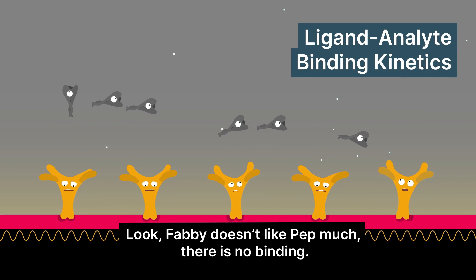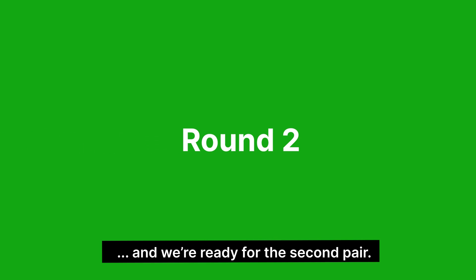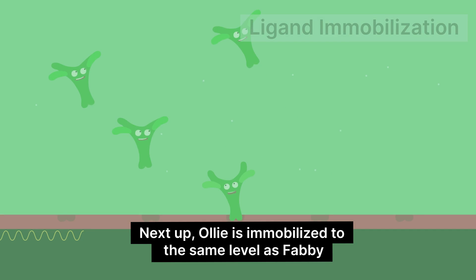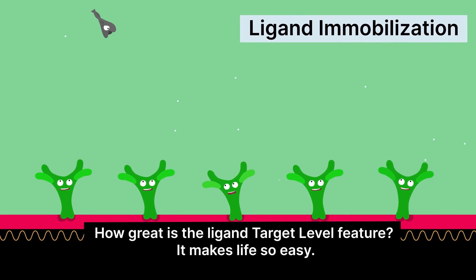Look, Fabi doesn't like Pep much. There is no binding. So the surface is fully regenerated, and we're ready for the second pair. Next up, Ollie is immobilized to the same level as Fabi. How great is the ligand target level feature?